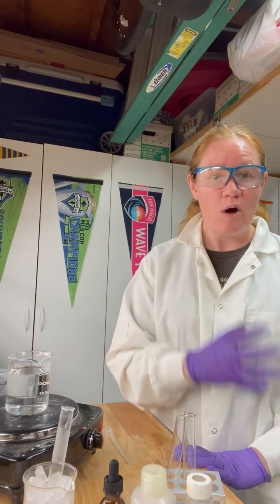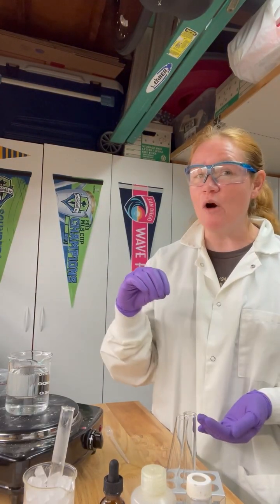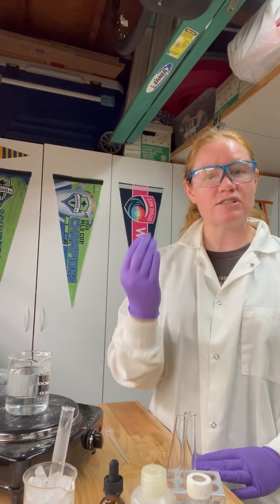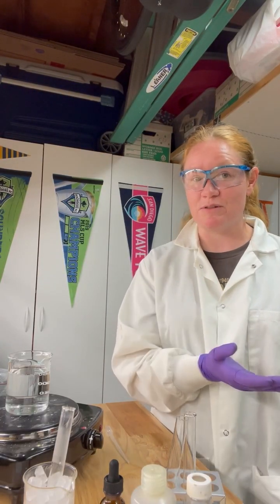Well, when we wanted to shift it back in the other direction, we removed those chloride ions from solution. So we took out one of the reactants. By taking out one of the reactants, my system needed to form more of those reactants. And so it consumed some of the tetrachlorocobaltate 2 ion and reproduced chloride ions. And as it reproduced chloride ions, it broke down those blue ions and reformed the pink hexaaquacobalt 2 ions, okay?